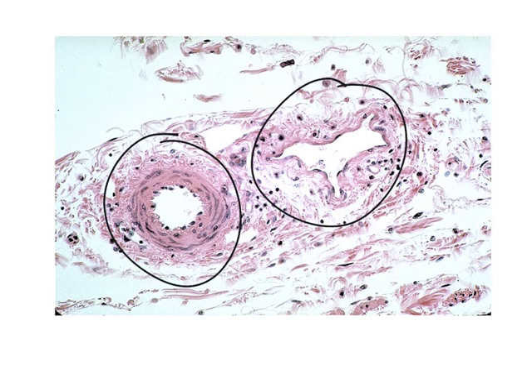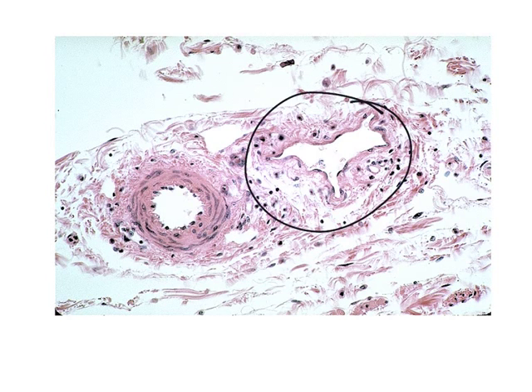But as you can see right here, in between the two black circles is that thick layer of muscle, and it's almost a perfect circle. You can see that this artery has this distinct circular shape, and then over here there's this vein which has this really thin layer of muscle, which is why it kind of looks floppy and like a flying pig or the bat symbol.